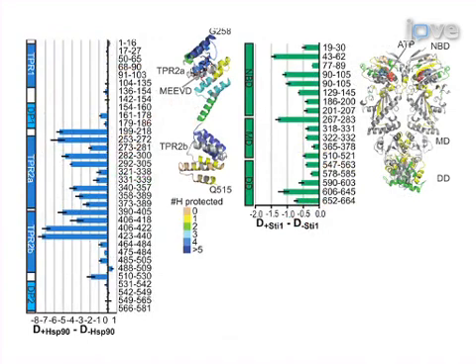Depending on the sequence coverage and the availability of overlapping peptides, binding sites can be narrowed down to a few amino acids. This method can help to answer key questions in the protein folding and the protein dynamics field, such as how proteins fold, how they unfold, how they react to physical and chemical impacts like temperature increase or heavy metals, how ligand binding and protein-protein interactions can influence the conformation of a protein.